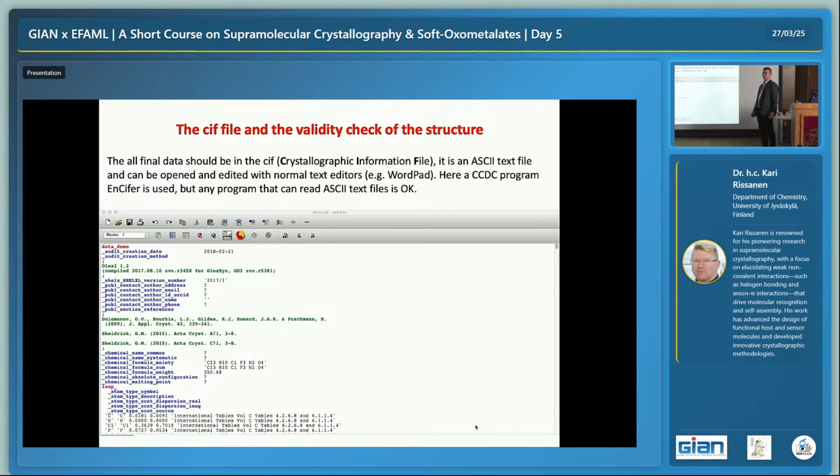We can look in. But where is it based? So the actual idea, where is the information we have gathered? That is actually in there. When we did the final part of the refinement, we clicked this ACTA there. The ACTA command makes the program write a so-called CIF file. So this is the CIF file. It comes from the name.cif, so this is the ending for this.